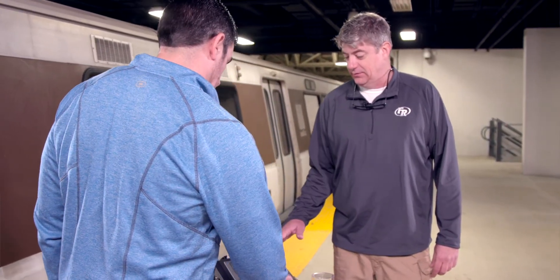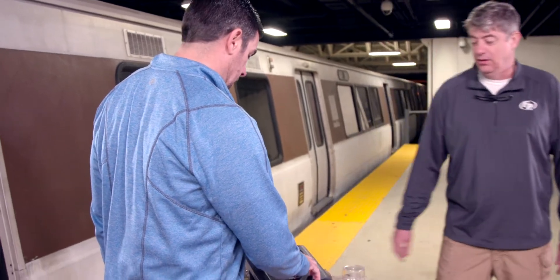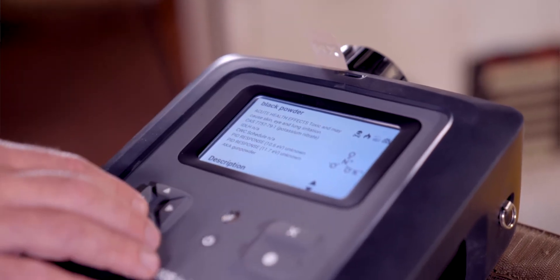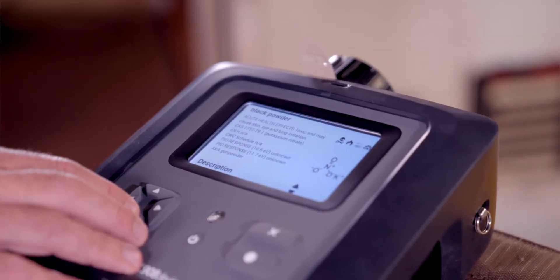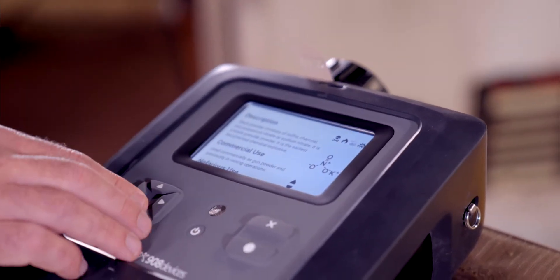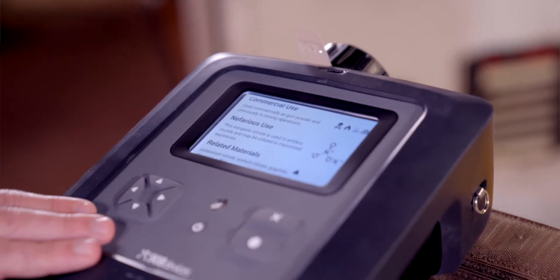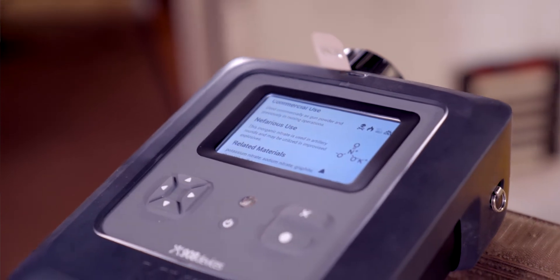And when you get a hit, you can go into details — gives you what it is, health effects, IDLH for certain chemicals or explosives that you might have, a description of it, the chemical use, the nefarious use, and related materials all within that product once you get a positive hit on an item.